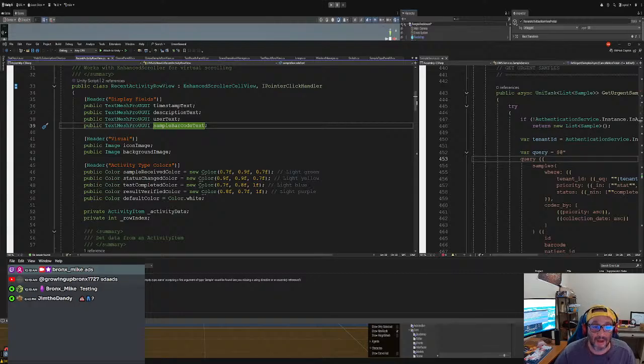All right, so now we have the cells and we do the same thing, same boring thing. Again, you could also just grab a prefab that you did before and shorten it, but I'm just going through this to go through the motions so I could show you guys. Okay, so we got here, horizontal, vertical, and then some margins so we don't bleed out the column.